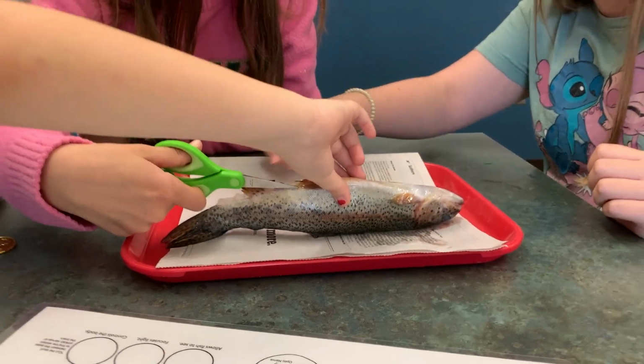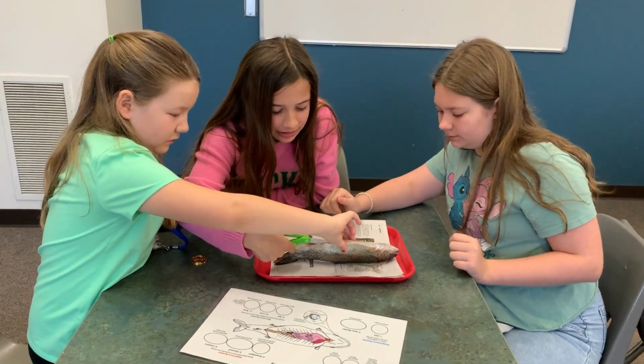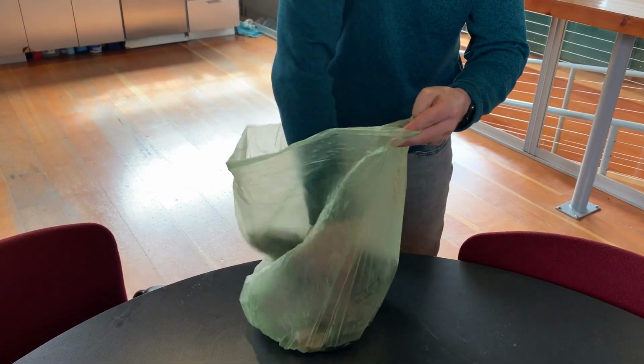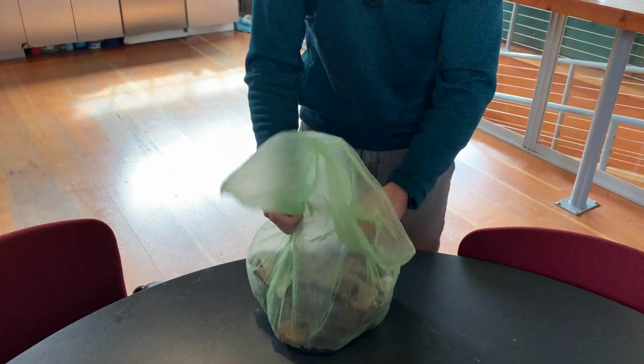Respecting that gift means keeping its body safely on your table, cutting only what you need for the activity, and putting its body into the compost bag at the end so its nutrients can live on in the garden.